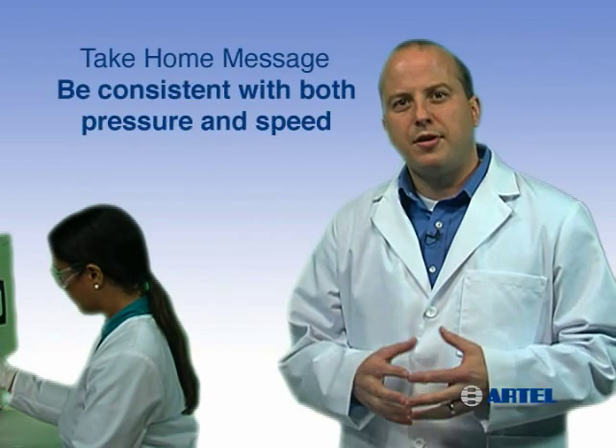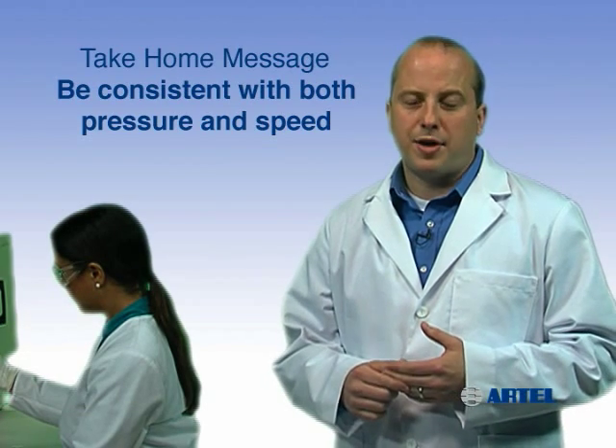The take home message is: depress and release the plunger smoothly with consistent pressure and speed during each sample transfer.